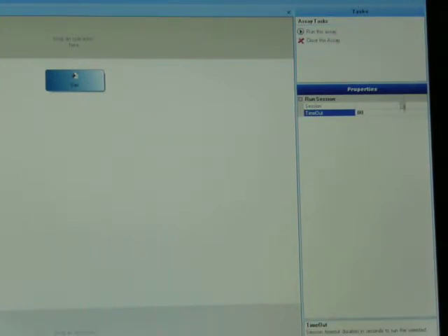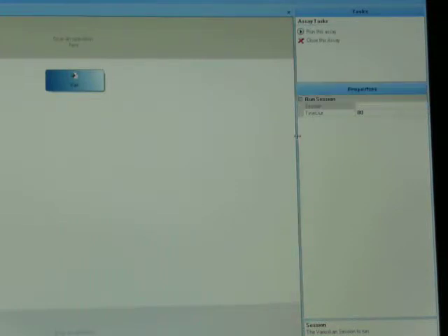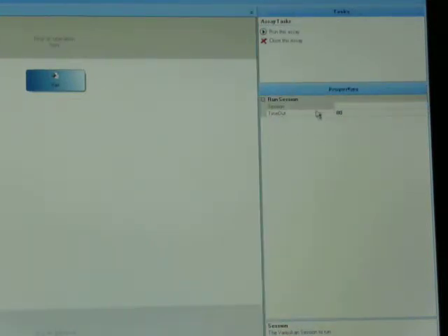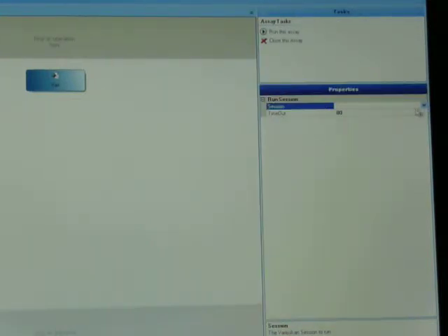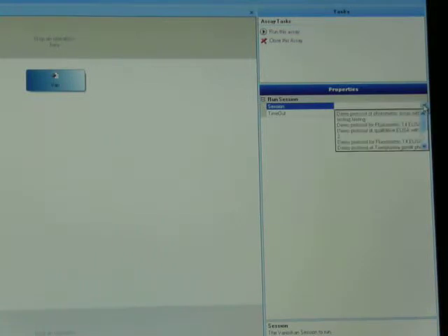What I really want to show you is the session. I'm going to click on the little arrow at the right of the session.